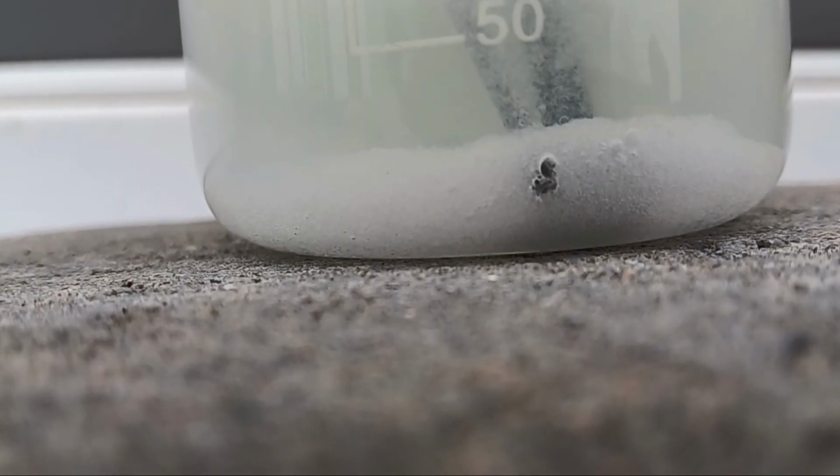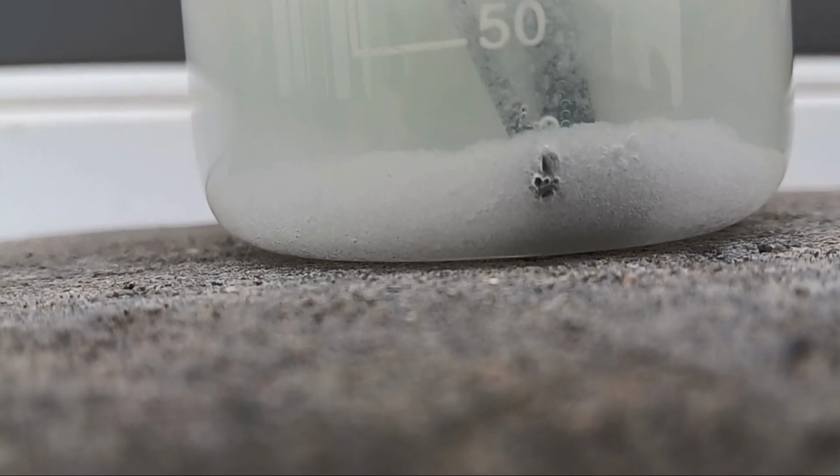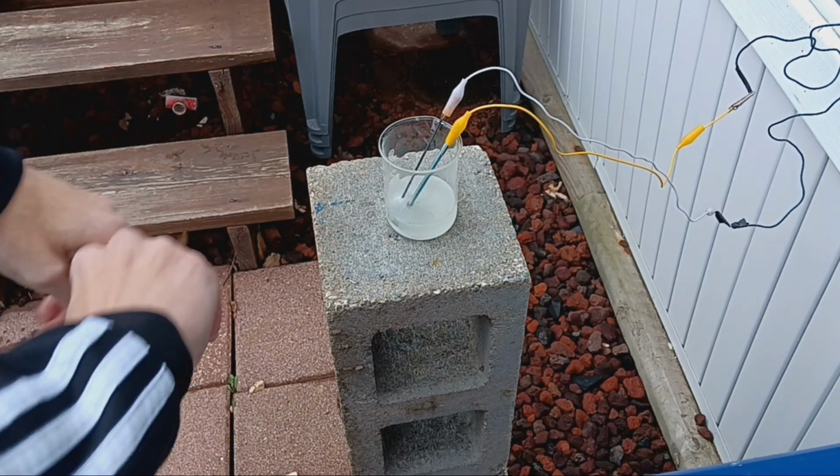What I found most surprising was the fact that the powder did not match the color of the liquid, and did not look red while drying, and much rather looked like a nickel oxide. Although I really doubt that it would actually be a nickel oxide.